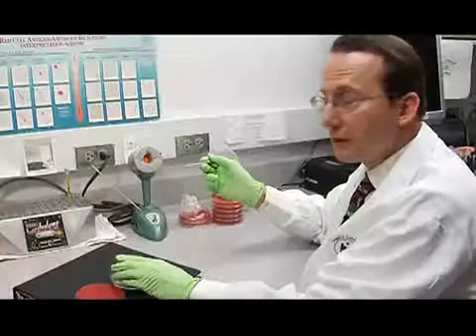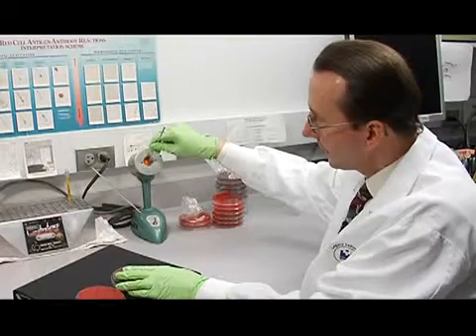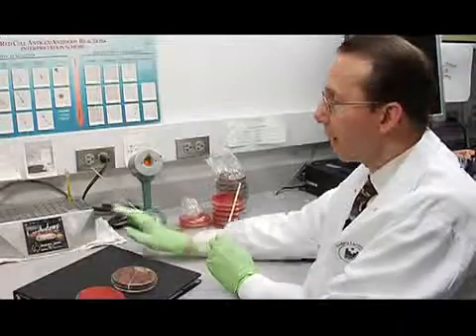So now I'm finished with setting up the female genital tract culture. And the next step is to Gram stain the smear.